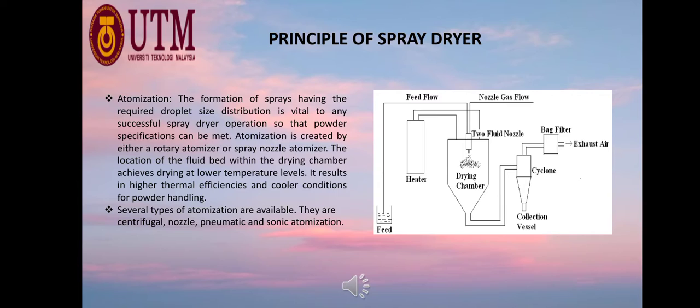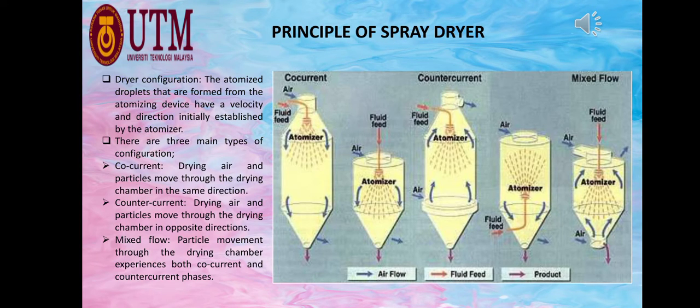And also, for the last atomization process, we have the sonic atomization. Here, this type of atomization employs the use of ultrasonic energy, where the passing of liquid over the surface is vibrated at ultrasonic frequencies. So moving on with the working principle, I'll share on the dryer configuration and its contribution to the performance of the system.